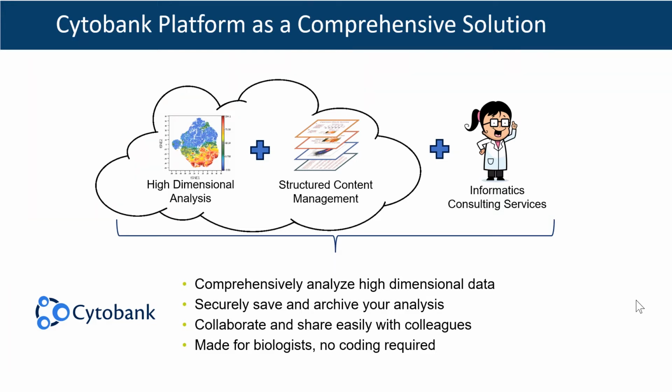The way that it works within Cytobank is we're just going to set it up and we're going to close our web browser, and then we get an email when our algorithm is completed. We can also run multiple analyses at the same time. So we can run multiple different algorithms at the same time within the cloud platform. So it allows us to do simultaneous runs, so we don't have to wait for the first run to finish and then go back and re-optimize it.